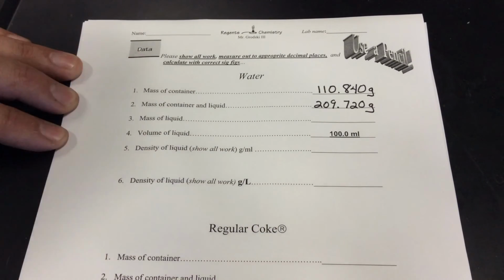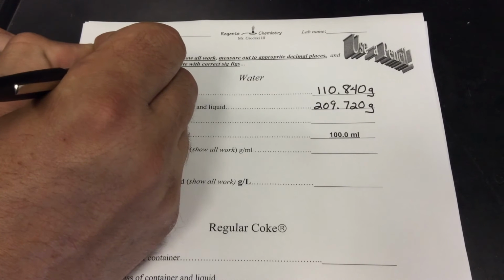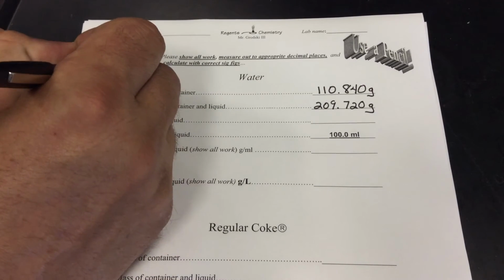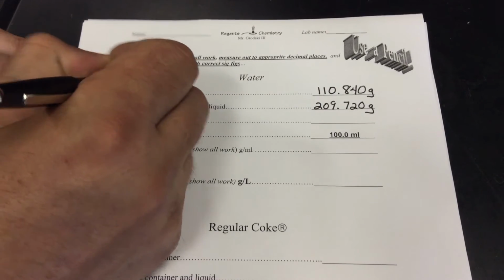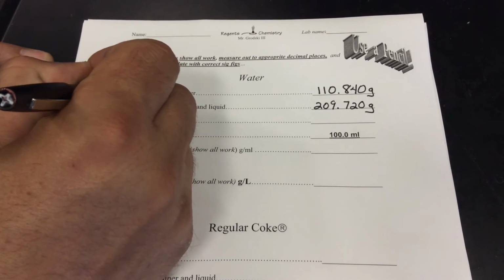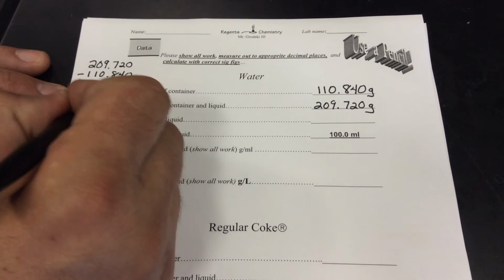So I'm just going to rewrite this, and it's always a good thing to put all your work in your lab, so you can see all your calculations. In more formal labs, we'll have a calculations page. So I'm going to subtract 110.840 from 209.720. Now of course you could have put that into your calculator, and what you would get is 98.880.